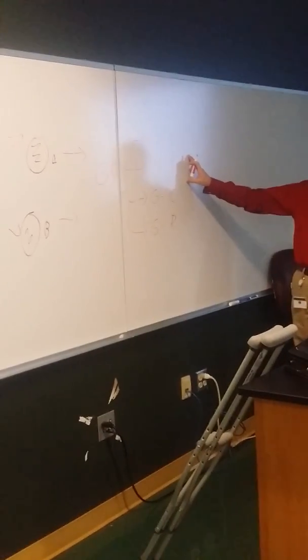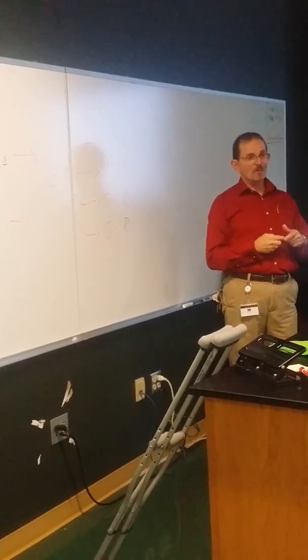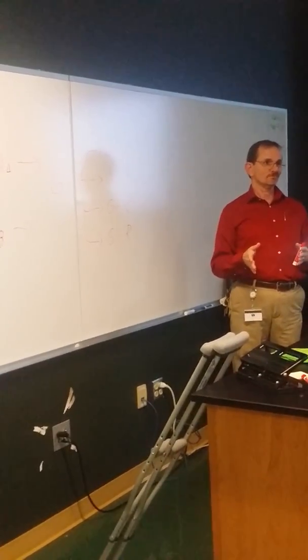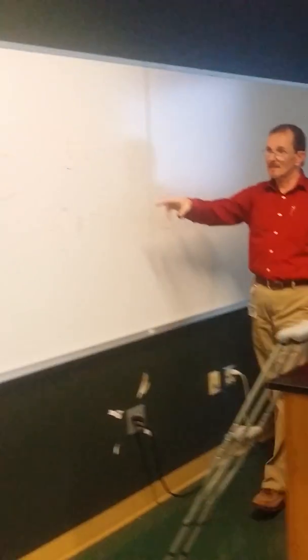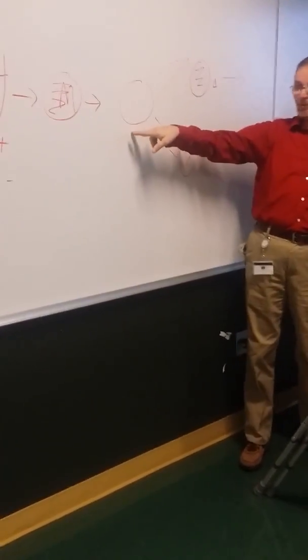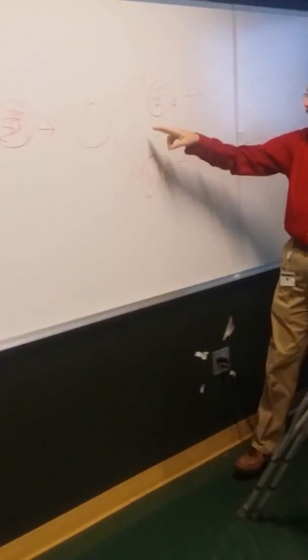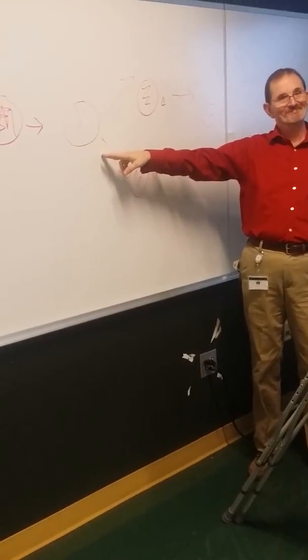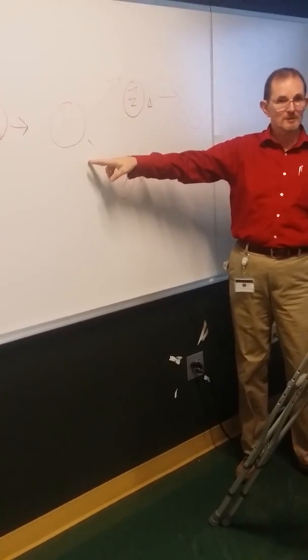Once you get to this point, that's when you start doing biochemical tests. We haven't done those labs yet. We're going to start that lab. I don't know if we're going to start it Wednesday or next Monday, but in any case, as you can see, you're going to need 2 days. And point of fact, you won't get this till Monday. If you are able on Monday, might not be able because we have to do the regular labs.